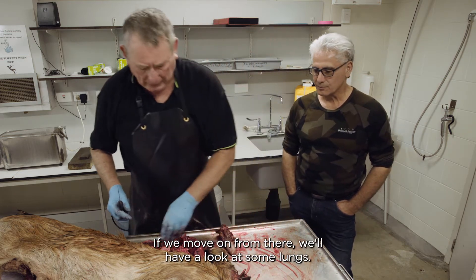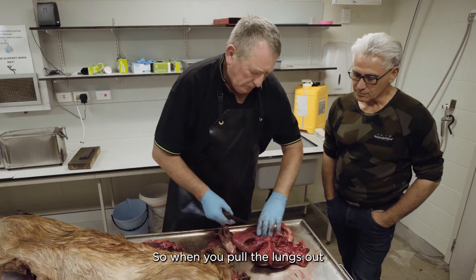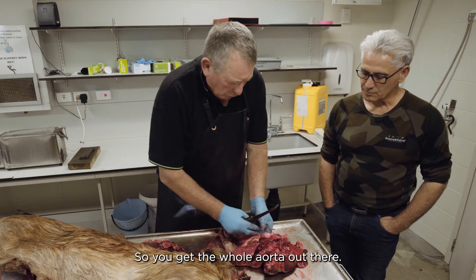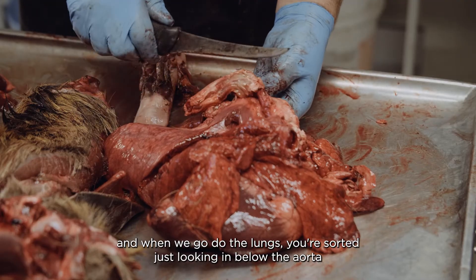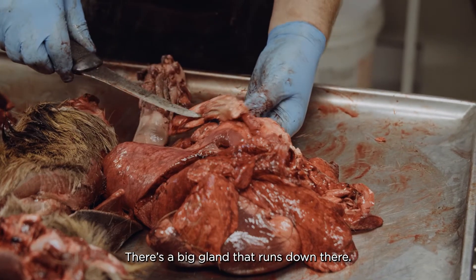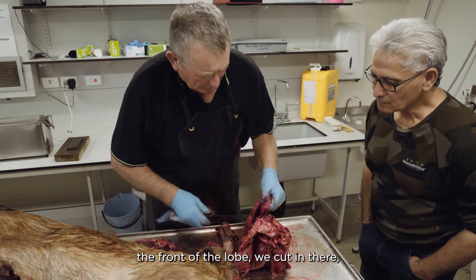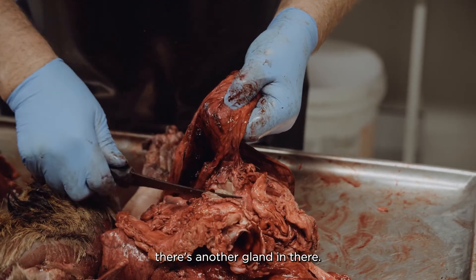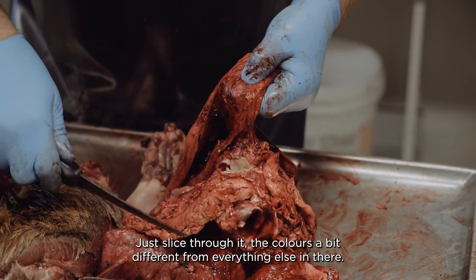Now if we move on, we'll have a look at the lungs. When you pull the lungs out, it's quite important to try and run the knife down the backbone so you get the whole aorta out. Looking in below the aorta, there's a big gland that runs down there. Then if we pick up the lungs at the front of the lobe and cut in there, there's another gland - just slice through it. The colour's a bit different from everything else in there.